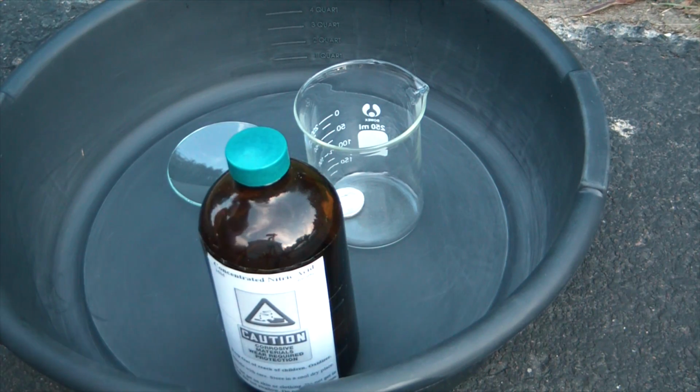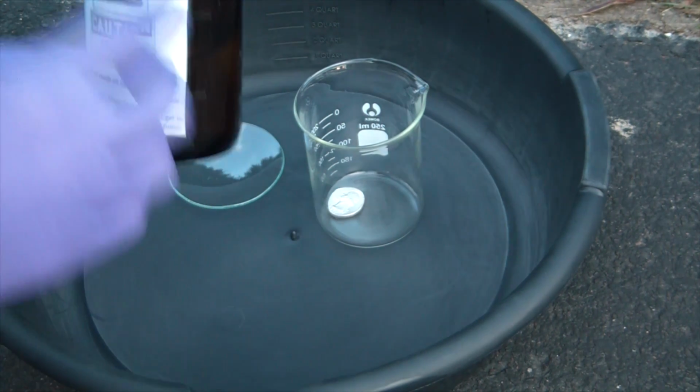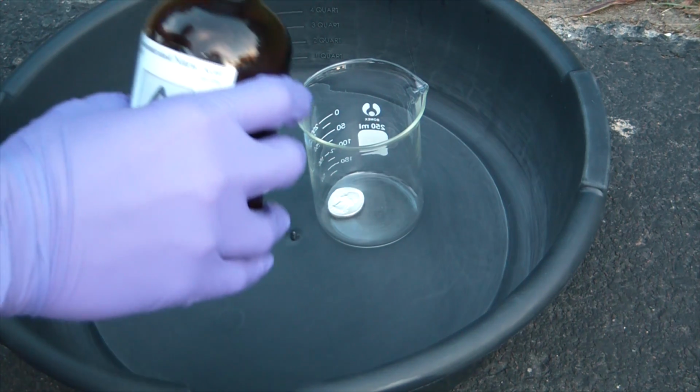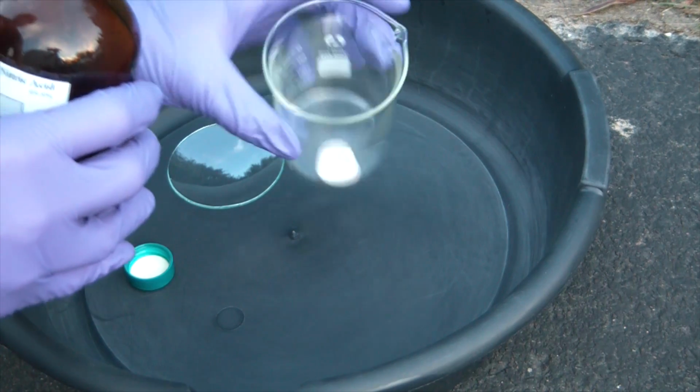So we've moved outside here. You can see I've got my bottle of concentrated nitric acid, 70%. And we are just going to add that to the beaker containing our silver quarter.